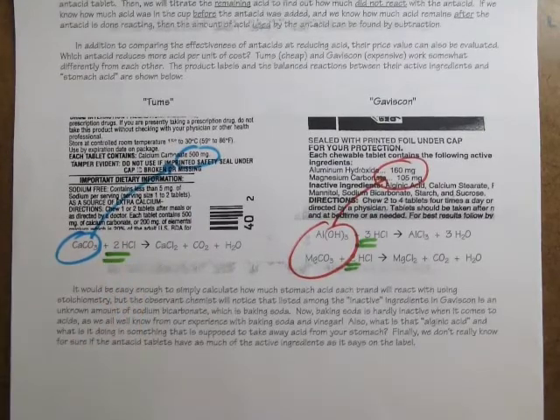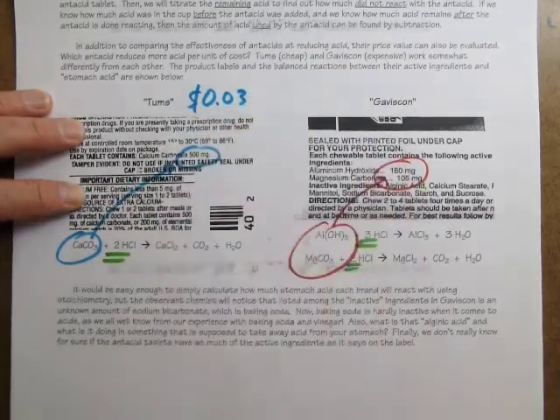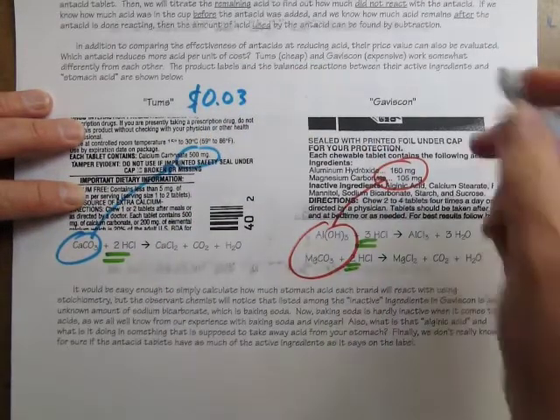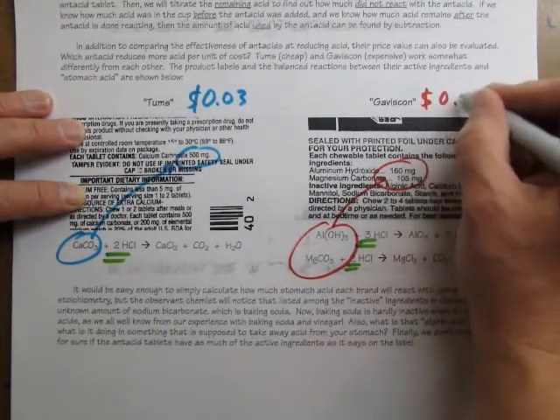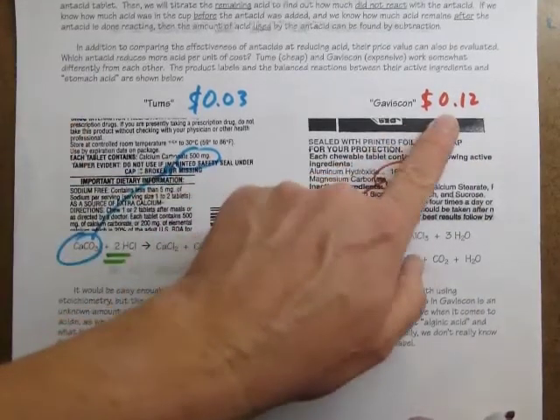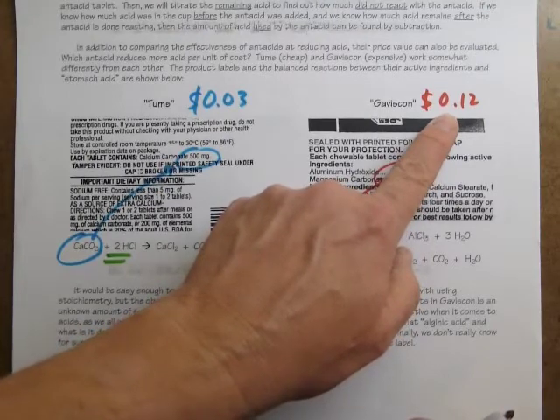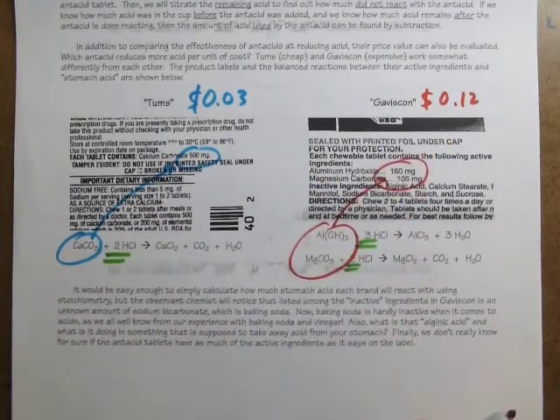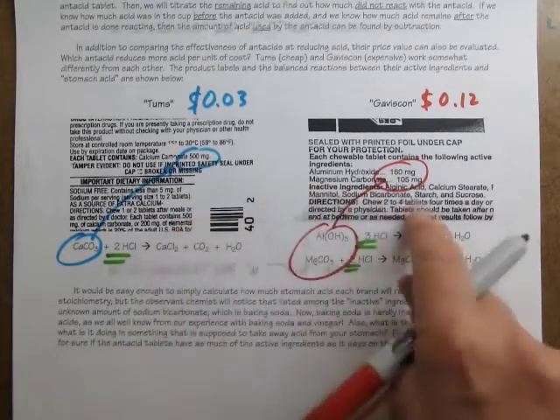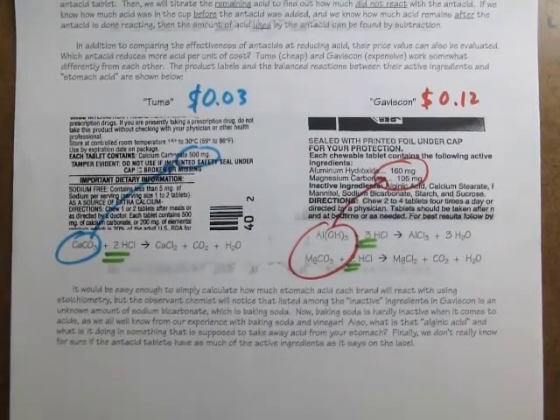But let's look at the price. Tums, each one costs 3 cents. Gaviscon is 4 times more expensive. It costs 12 cents each tablet. So if it costs 4 times more, do you get 4 times the strength, the acid reduction strength? That's what we're trying to find out in our experiment. Which one of these two can use up more hydrochloric acid in a sample of stomach acid?